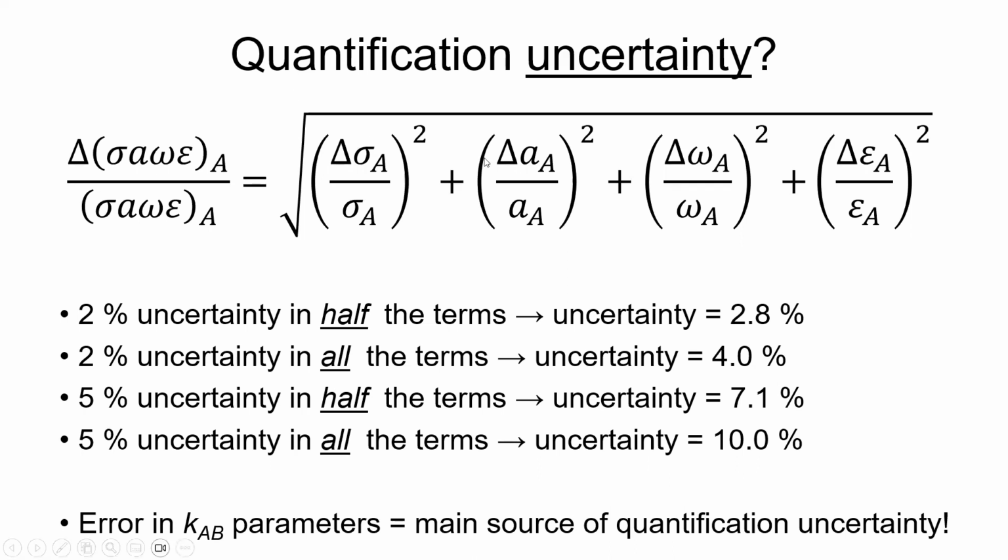The transition probabilities, those are known to a little bit higher accuracy, right? Because those are based on experimental X-ray data, okay? The fluorescence yield data as well. So those are measured experimentally, but again, you do have uncertainty with those as well. And then the last one, you have the uncertainty related to your detector, okay? And, again, those curves are calculated theoretically. They're not usually measured experimentally, okay? Difficult to do that. So, when you look at this, you do have reasonable sources of uncertainty with all of these things, okay?